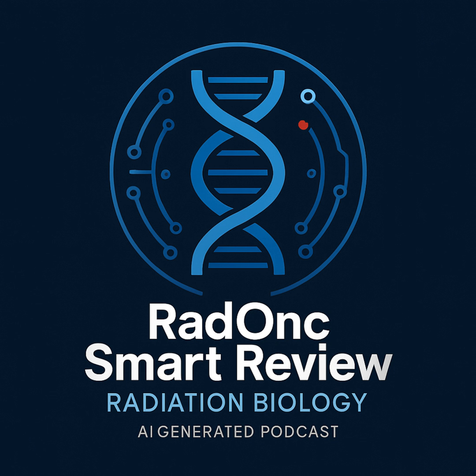Got it. Okay, let's break down Southern first. It detects DNA, named after Edwin Southern. How's it work?